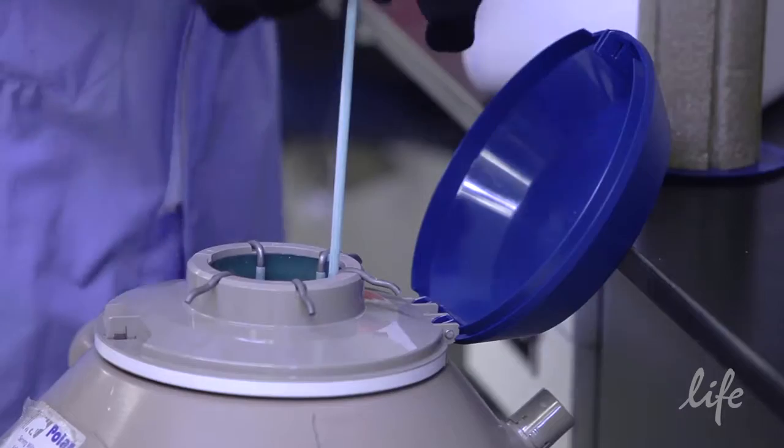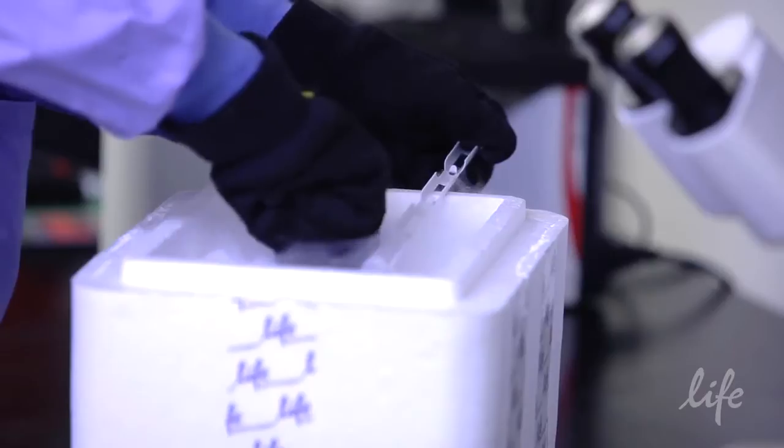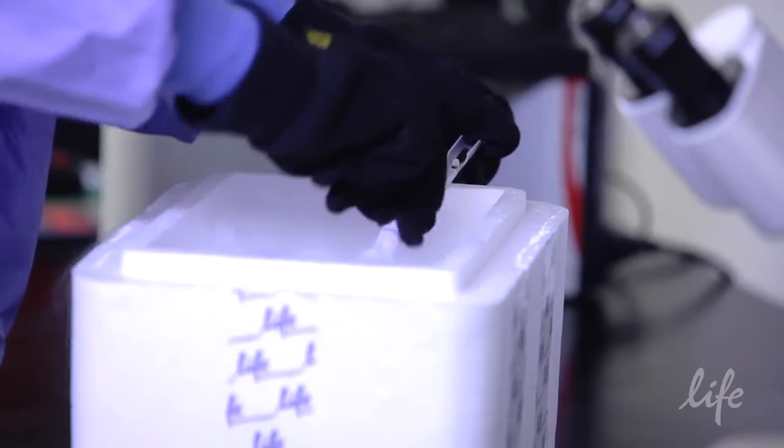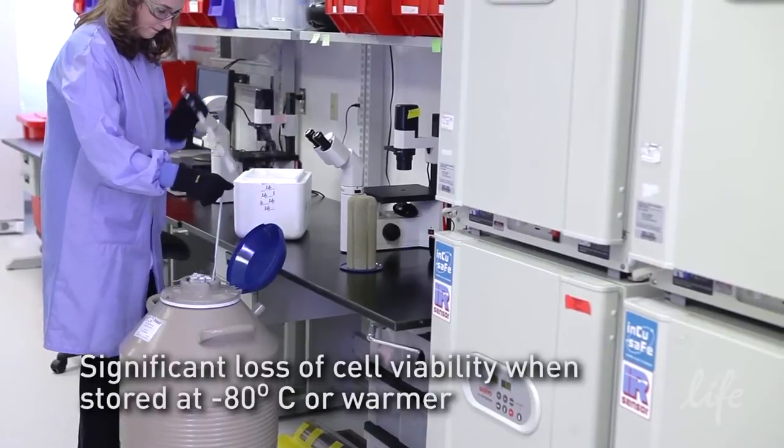Cryopreserved primary cells can be stored in the liquid nitrogen vapor phase for greater than two years with minimal loss in viability. Storage at minus 80°C or warmer will result in significant loss of cell viability.